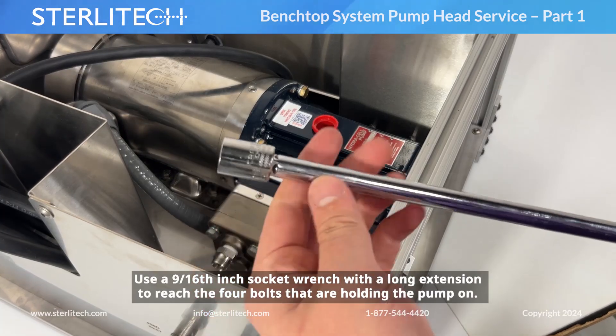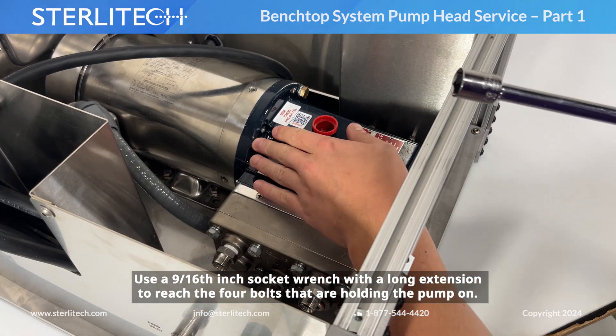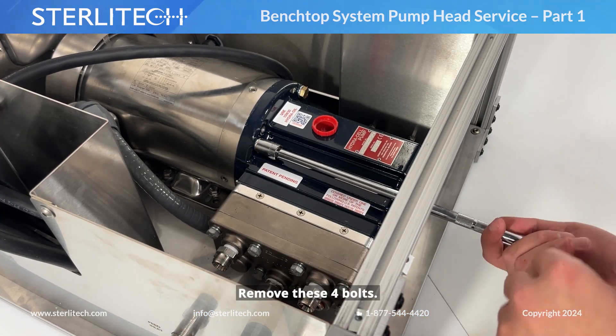Next, we're using a 9/16-inch socket wrench with a long extension so that we can reach the four bolts that are holding our pump on. We're going to remove these four bolts.